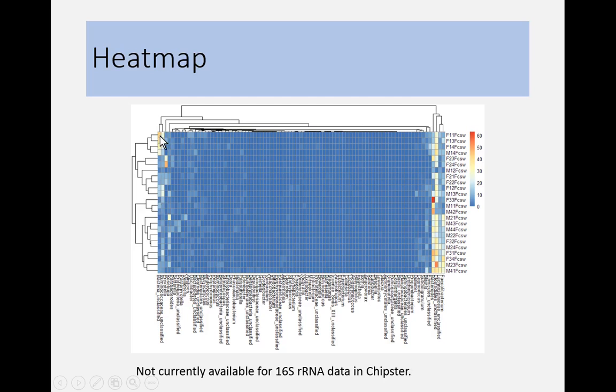And if you check these, well, you know what is a heat map, do you? Who doesn't? Well, okay, what I'm talking about here then. But this is one rather nice way to visualize the total dataset too. If you have a very huge dataset, you can. Yeah, go ahead.